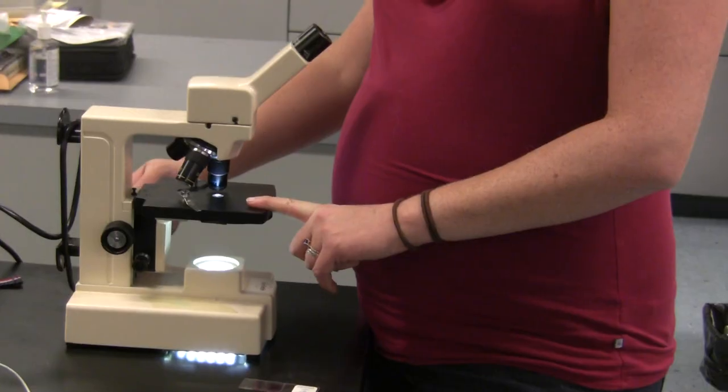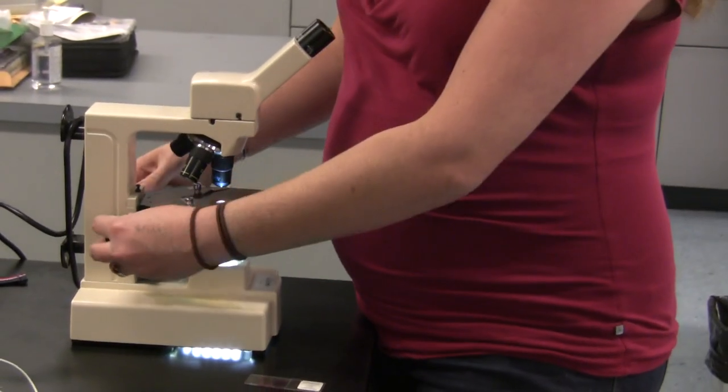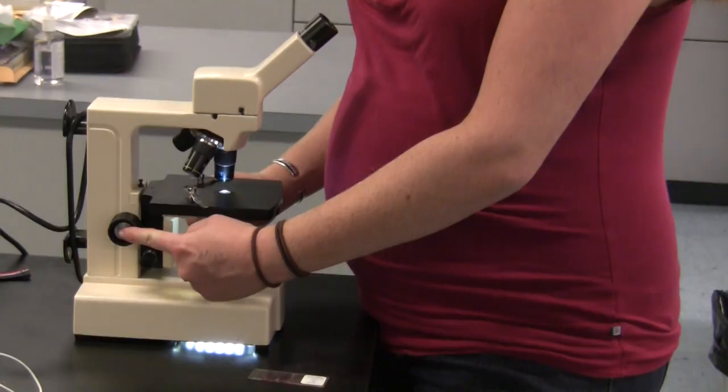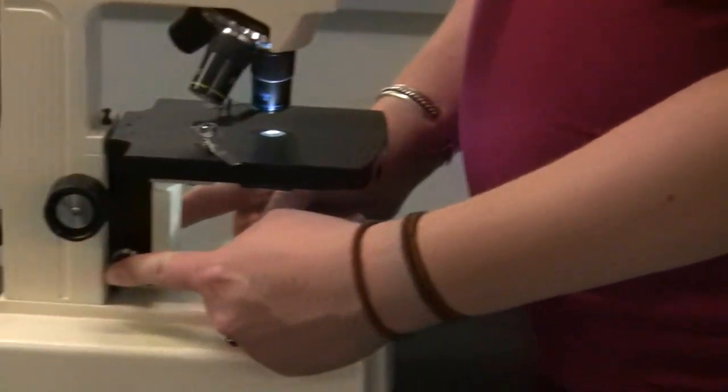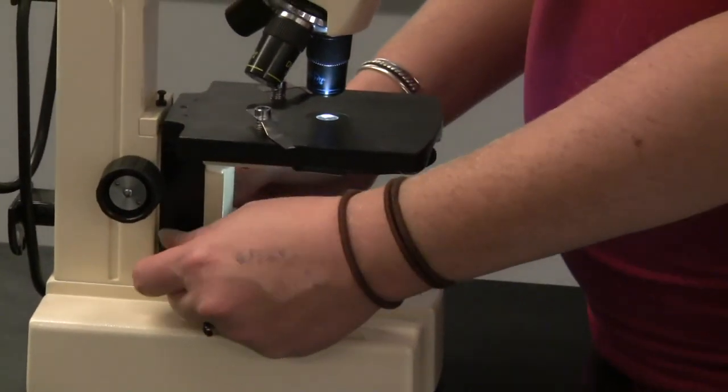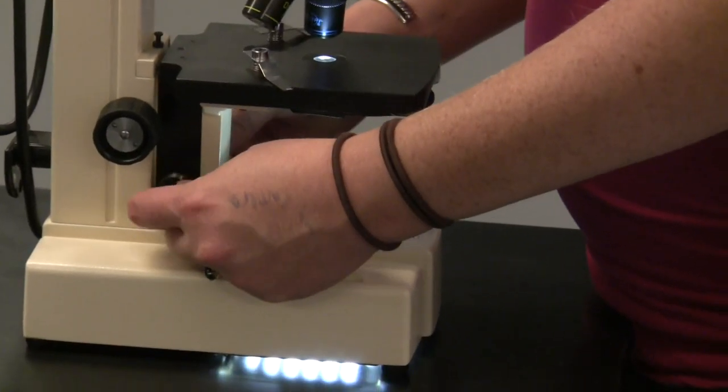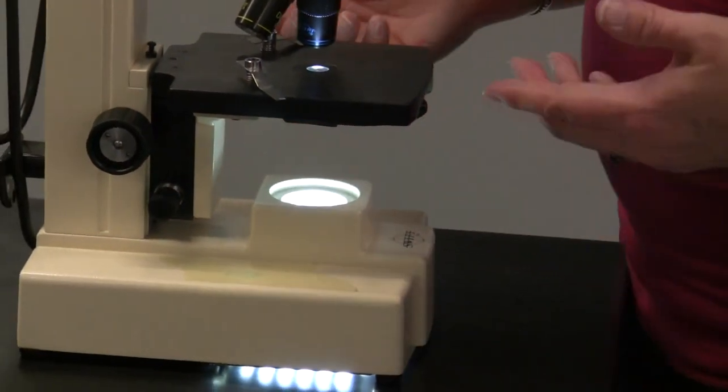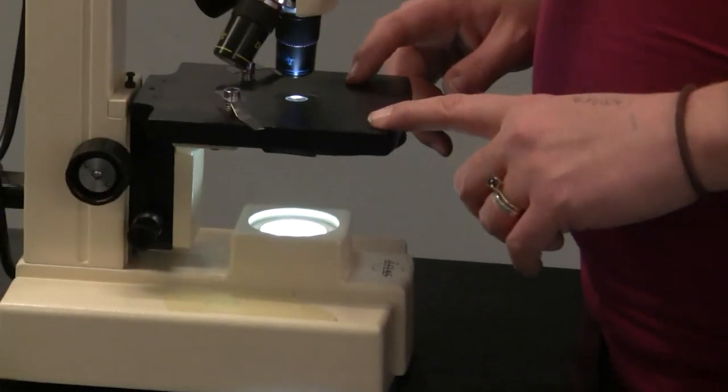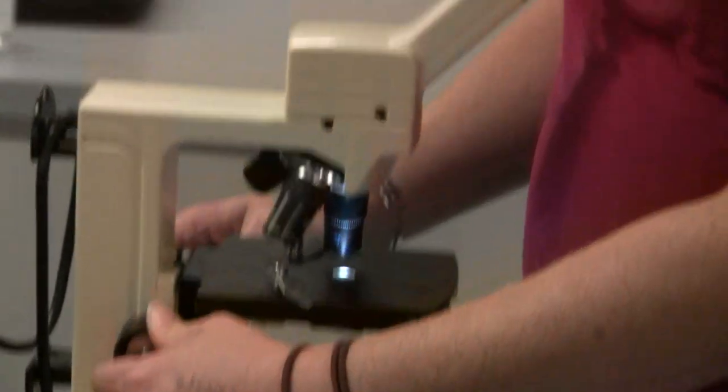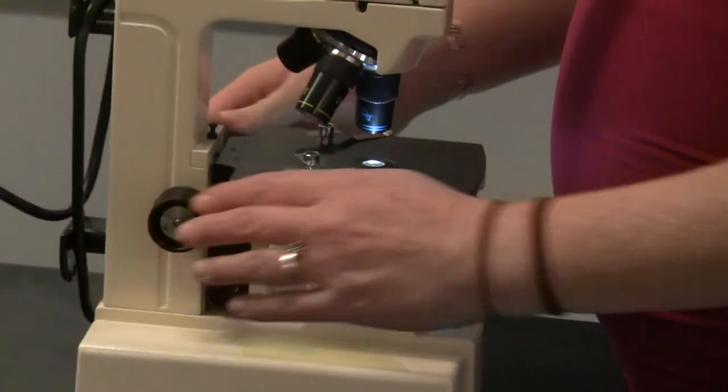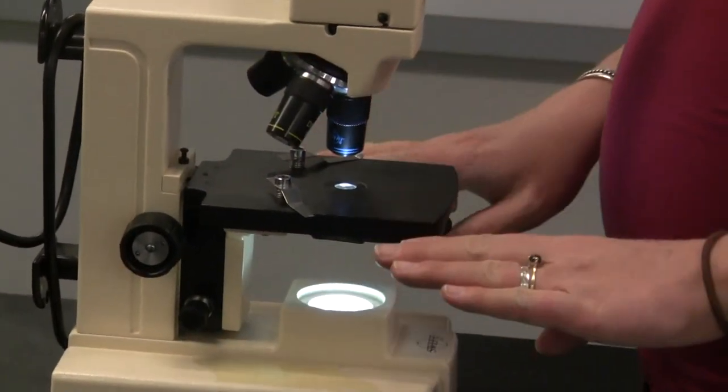So the stage goes up or down based on these knobs. We have our coarse adjustment knob and the fine adjustment knob. The fine adjustment knob is so small and has slight changes that it's honestly even hard to tell that the stage is moving. So it's best to start by using the coarse adjustment knob and lower it as far as it will go.